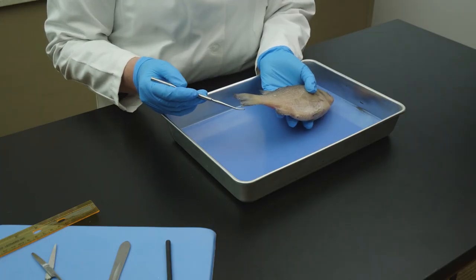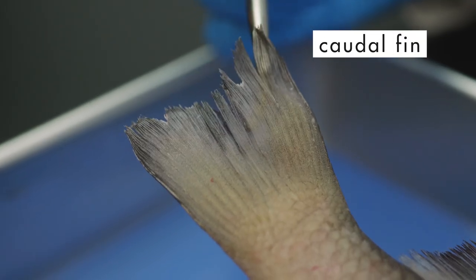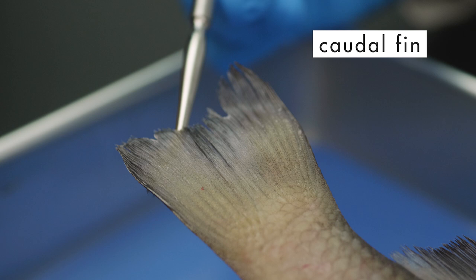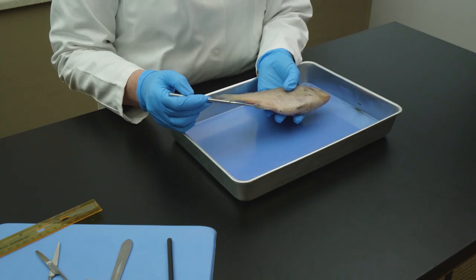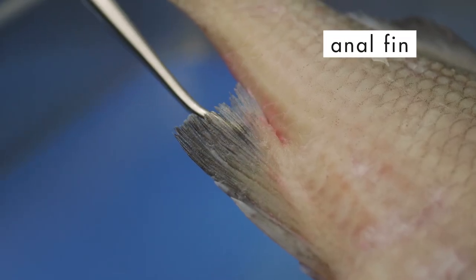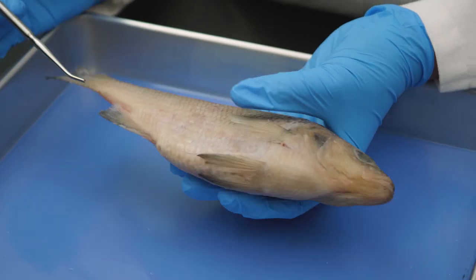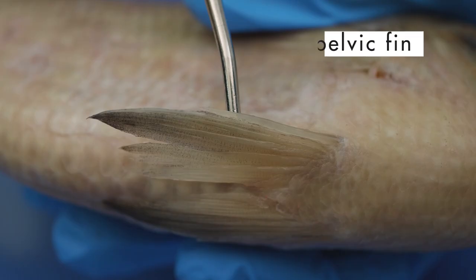The largest fin is the caudal fin, which is located at the tail of the fish. The caudal fin is a movable fin used for propulsion. On the ventral side of the perch, just anterior to the caudal fin, is a fixed fin called the anal fin. The anal fin is used for balance. Beneath the pectoral fins are 2 pelvic or ventral fins. The pelvic fins are movable fins used for steering and diving.